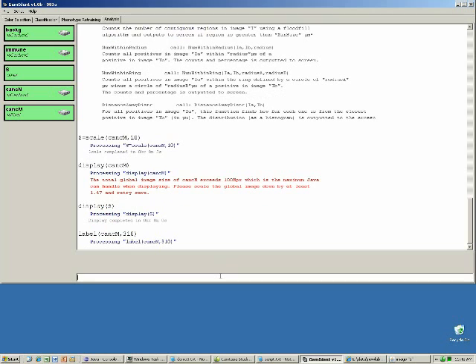Now let's let this run. Notice that the analysis page is fully parallelized. There is no limit to the number of commands that can be executed simultaneously, and all available CPU cores will be used. Compare this to other languages such as R and MATLAB, which take single commands in series and only use one processor.